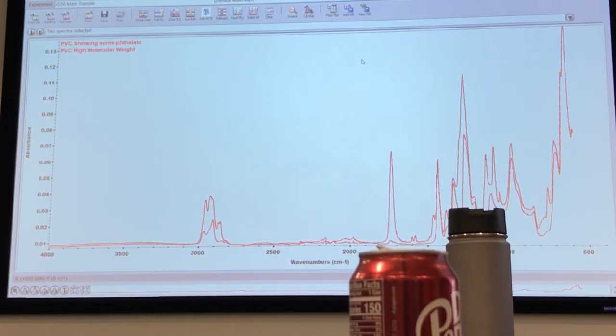The other common thing you'll see is silicates. Why? Because it's everywhere, right? I mean, you may have the cleanest air, but you open your Petri dish once, you'll get at least 2 or 3 particles in it, easy. This is in the nicest, cleanest clean rooms you can find. So a lot of clean rooms leave little wafers right on the bench, and then they check it every week to see what they're collecting, because that's their background, right?